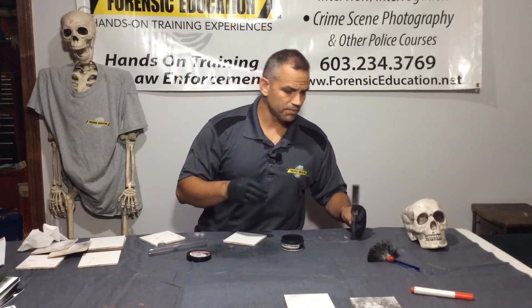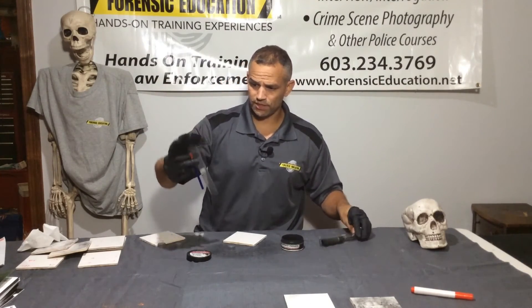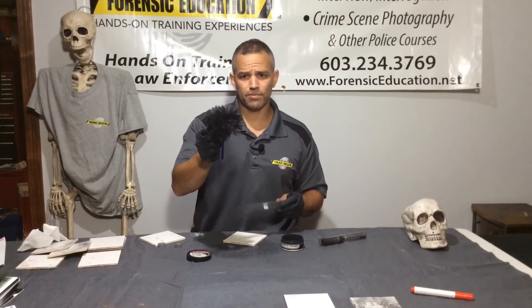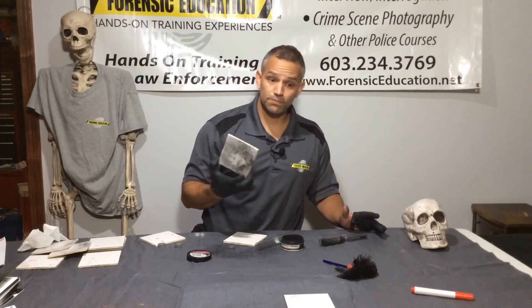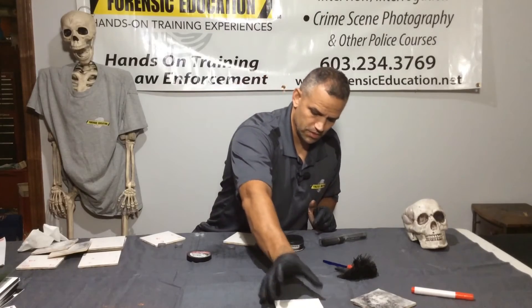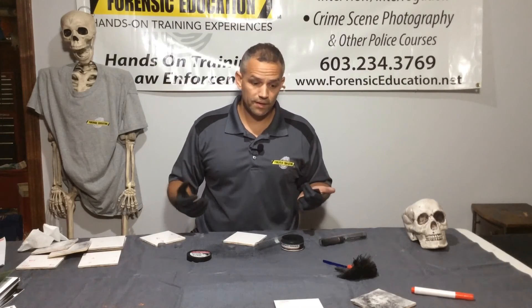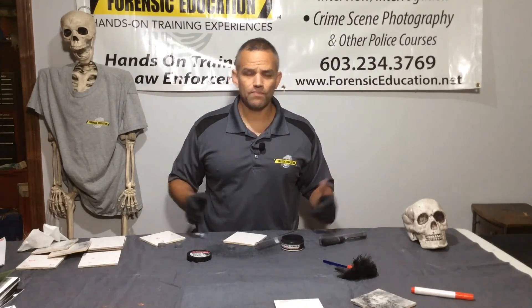So those are the simplest four errors: not taking care of the brush — you keep putting it away properly; using too much powder; wiping away your fingerprint by over-developing it; or wiping it away using the paintbrush stroke. These are the simplest errors to correct. Just use a tiny bit of powder. You can super glue fume it first so that if you do make an error you can go back over it. Just take care of your equipment and you're going to be very successful.